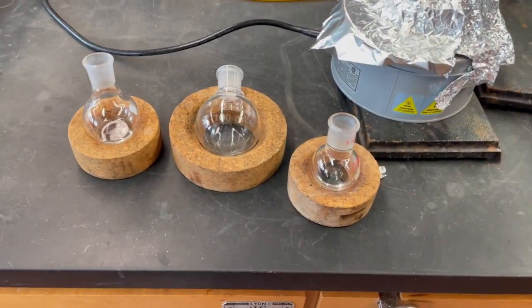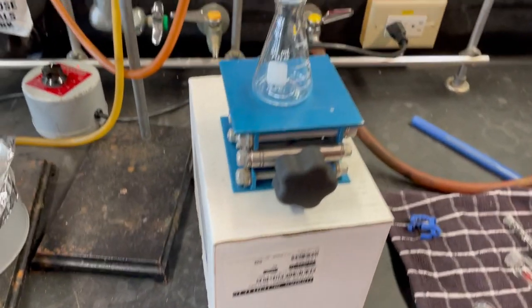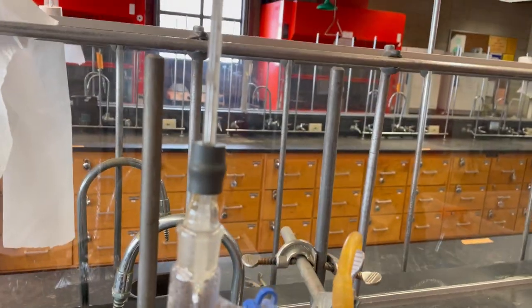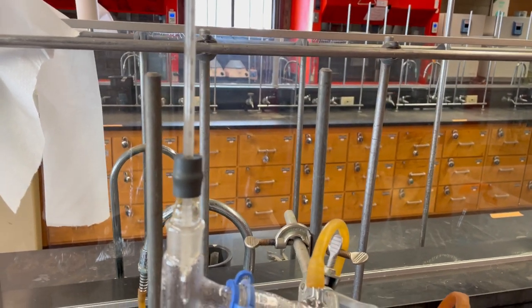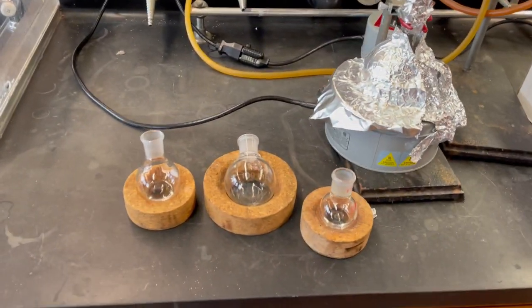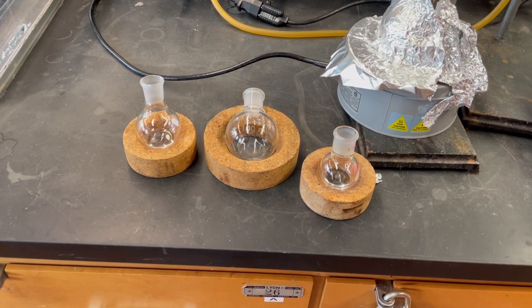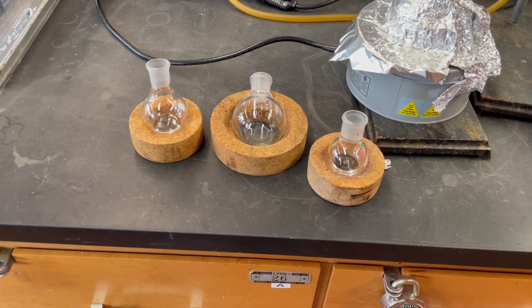Okay, so what we got here is fraction 1, 2, and 3. I also just kind of switched it out and put a flask there. And the temperature, again, you can't really see it, is pretty high. It's at like 100 now, so that should just be water, right? So what we want to do is take these and measure the density, so that way we can identify the percent composition of ethanol in this solution.